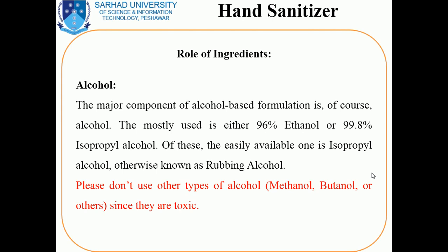Please don't use other types of alcohol like methanol, butanol, or others, since they are toxic. There are other types of alcohol available, but we will not use them because of toxicity. Ethanol and isopropyl alcohol, that is IPA, are not toxic, and we prefer to use these.